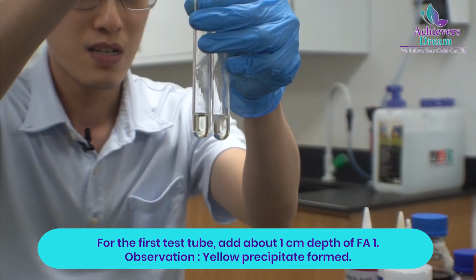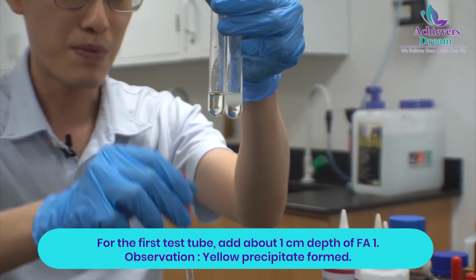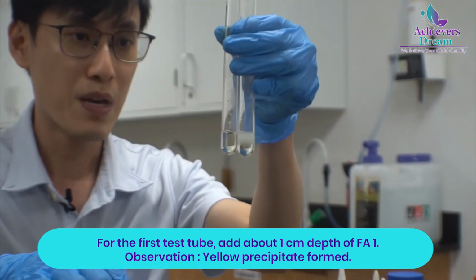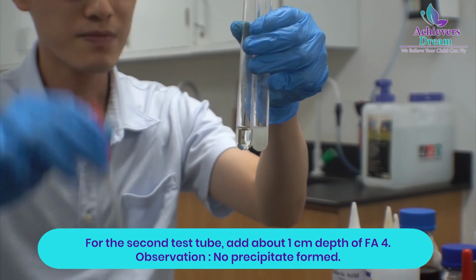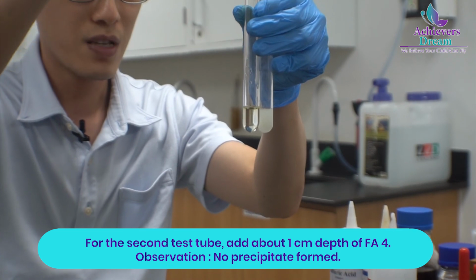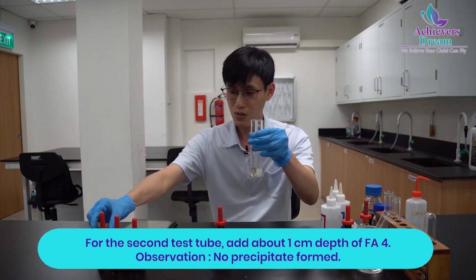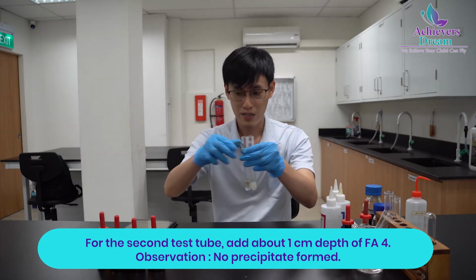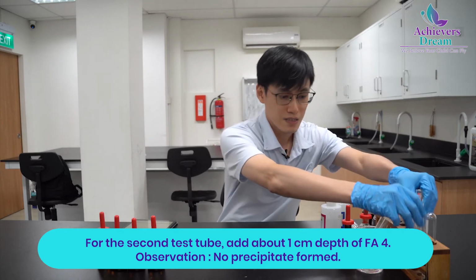As you can see, a bright yellow precipitate appears. You can say pale yellow too. Let's try for Fa4. Adding Fa4 in produces no precipitate. So we can conclude that Fa1 has the iodoform group, but Fa4 doesn't.